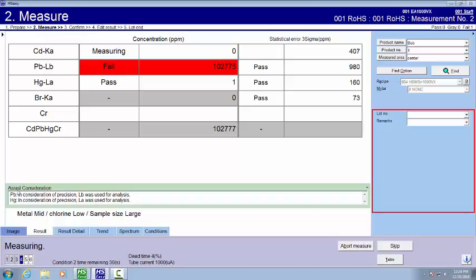You also see down here where it says assist consideration. Lead was measured using L-beta and mercury using L-alpha. That was chosen probably because there were interferences with other elements. So it chose the best one for this analysis.